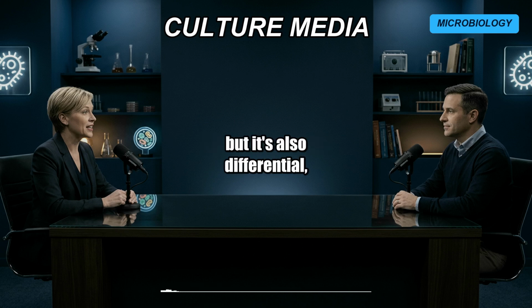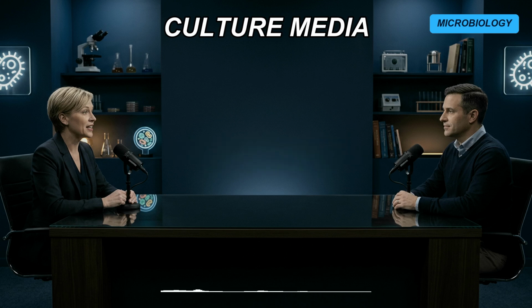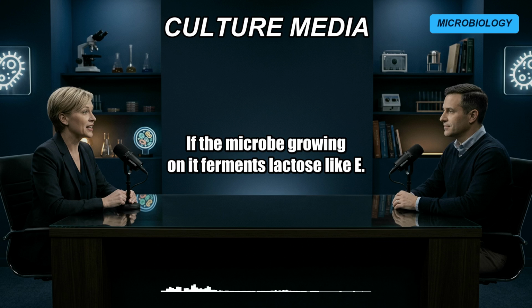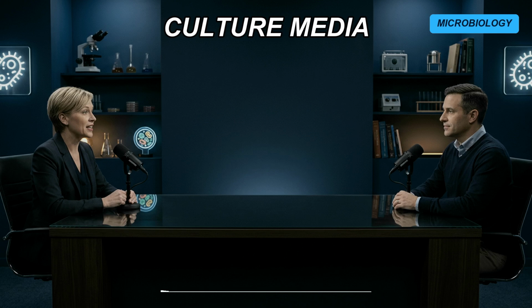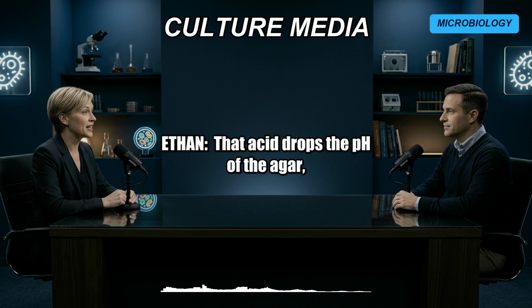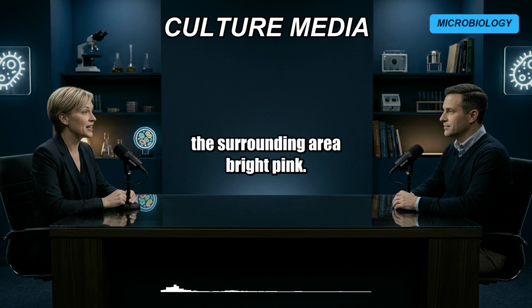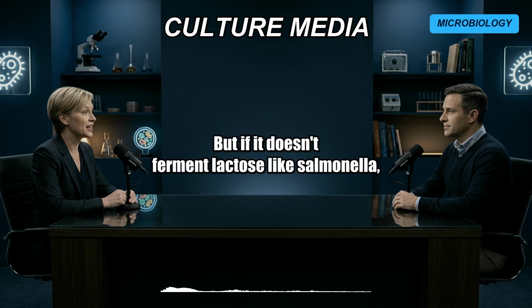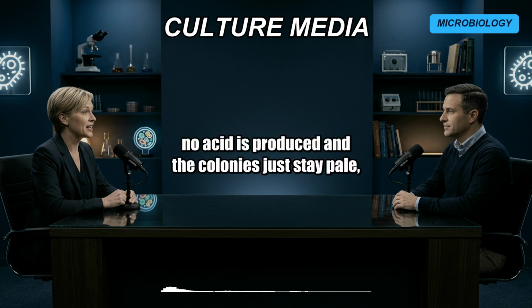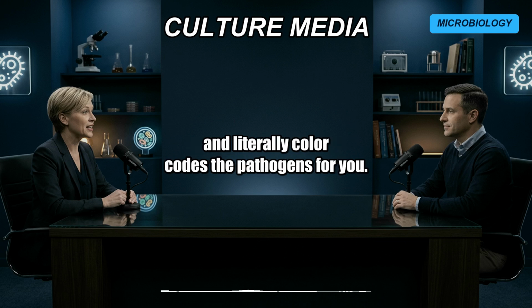Now, MacConkey is selective, but it's also differential, meaning it doesn't just filter, it diagnoses. Yes, the color coding. Right. It contains a sugar, lactose, and a pH indicator dye. If the microbe growing on it ferments lactose, like E. coli does, its metabolic byproduct is acid. And acid lowers the pH. Exactly. That acid drops the pH of the agar, reacting with the indicator dye to turn the colony and the surrounding area bright pink. It's very dramatic looking. It is. But if it doesn't ferment lactose, like Salmonella, no acid is produced and the colonies just stay pale. You get a single plate that filters out the junk and literally color codes the pathogens for you.